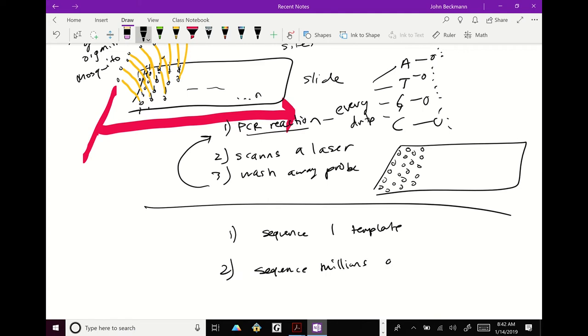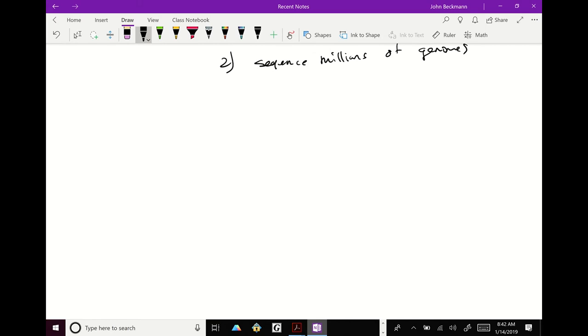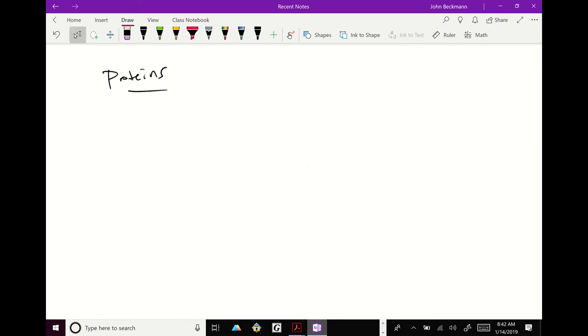Okay. All right. We're done with nucleic acids, on to proteins. We only have 10 minutes left for proteins. And proteins are what I like. Okay. So SDS-PAGE, I know this is review. It should be. Has anybody not heard of SDS-PAGE? You have? Okay, I should have started with proteins then. That's okay. That's good, because this is fun.